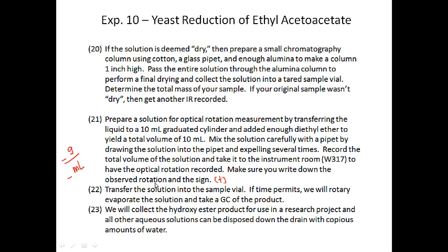Then after that, you'll transfer the solution into a sample vial, and then if time permits, you'll rotary evaporate the solution and we'll take a GC. We'll see how that goes. The hydroxyester product that you get, I actually collect and then I'll purify it, because we have a use for it in one of our research projects. All the other aqueous solutions can be disposed of down the drain with copious amounts of water.